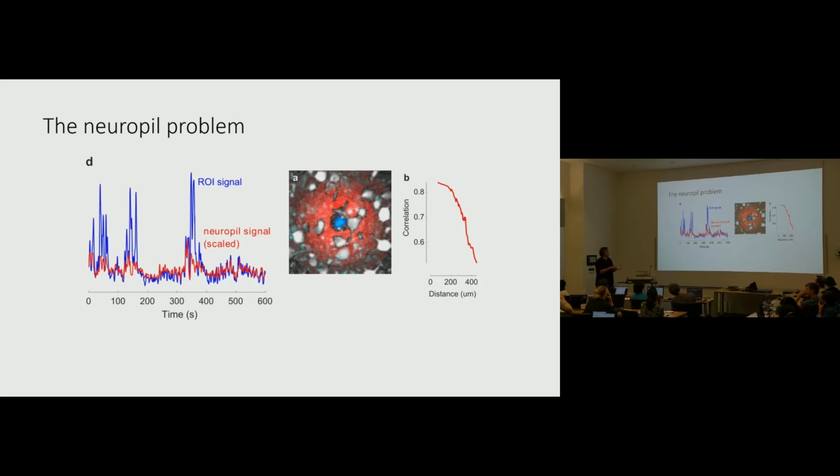And so to the extent that we can really get those pixels, it doesn't matter which pixels around the cell we take. Right, so you exclude other ROIs around it. Yeah. Sometimes we have to go a little bit further. If the recording is very dense, there might be a lot of these ROIs, so we might have to go a little bit further, like in CA1. So let's discuss those kinds of examples when we get to the practical. I think that's a special case that we should think about more carefully.